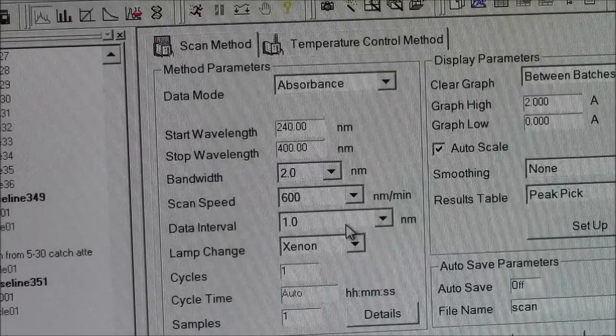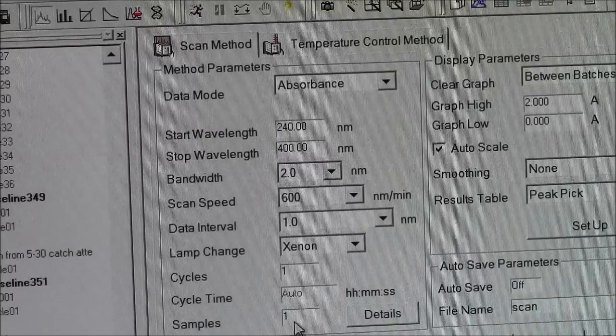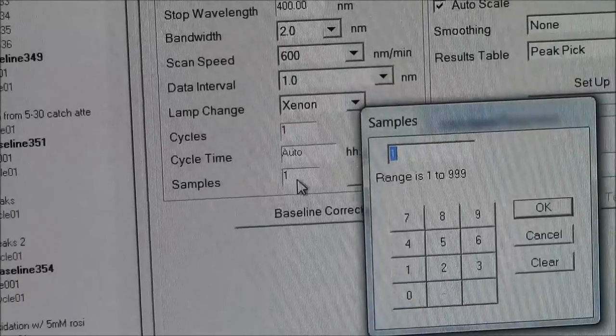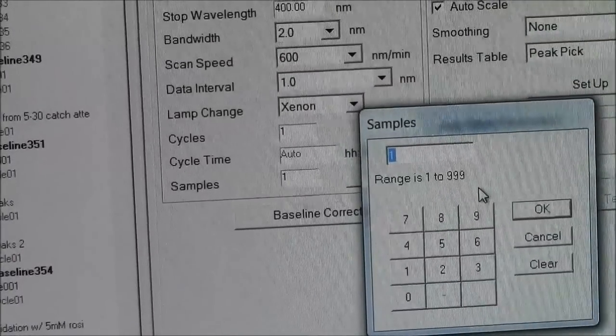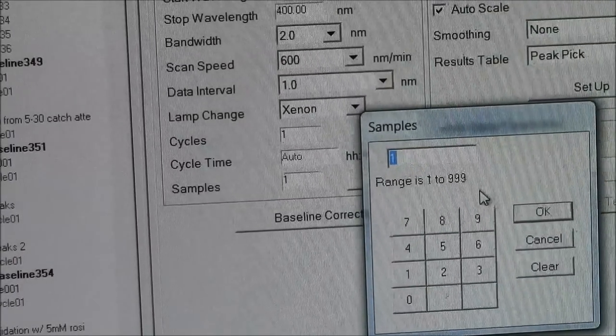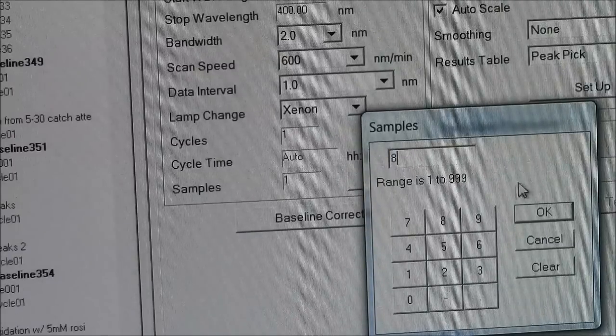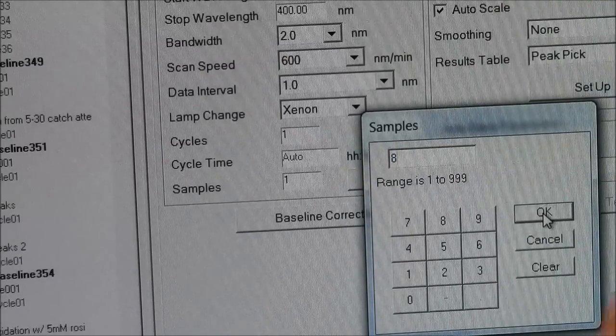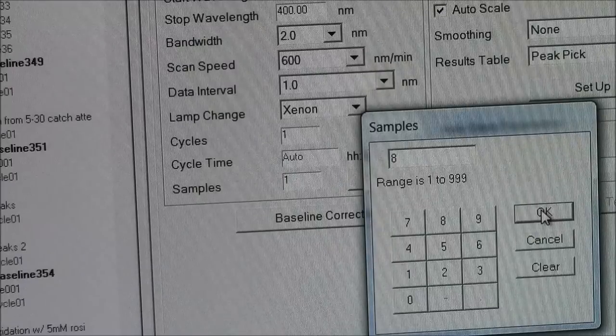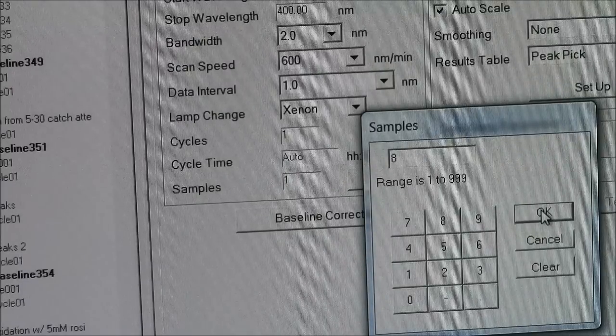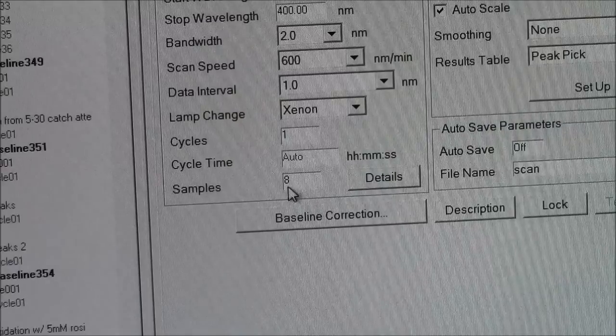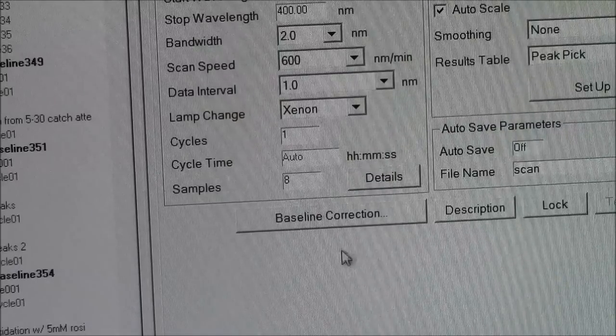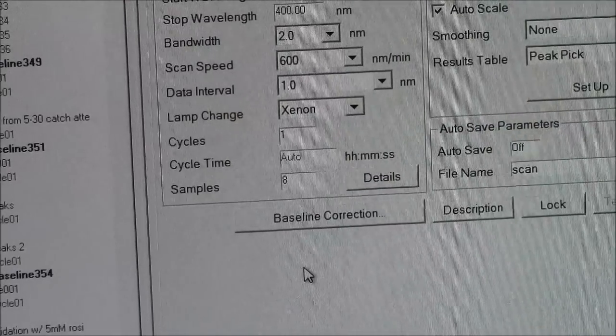Number of samples here. You can say, as it says here, range is 1 to 999. Typically I make this about 8. If I had more samples than that, then I would make it whatever number of samples I have. But 8 is plenty. It allows me to make some mistakes. It allows me to get a number of different samples on the same graph, in the same batch is what it's called.